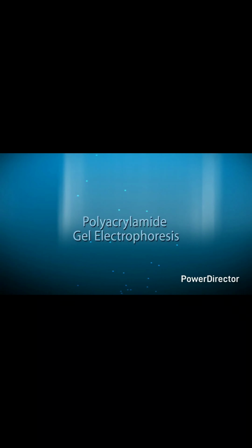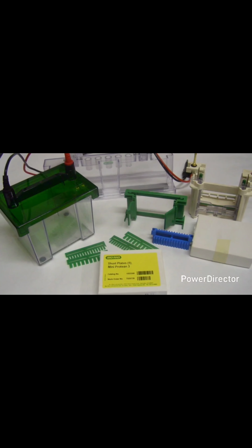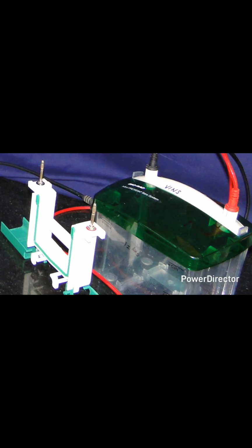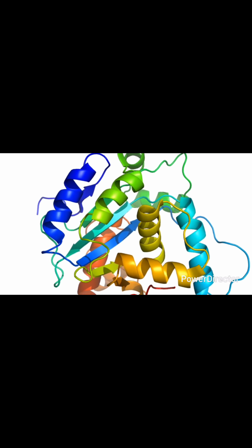My name is Mbobombi and I'm talking on polyacrylamide gel electrophoresis. Polyacrylamide gel electrophoresis is the most widely used analytical method to resolve separate components of a protein mixture based on size. For these protein molecules of different shapes and sizes, they need to be denatured. This is done with SDS. The proteins covered by SDS are negatively charged.